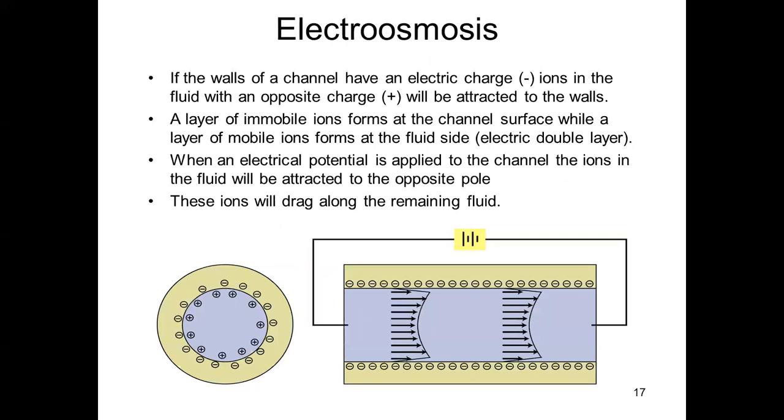So electroosmosis, if we take a detailed look at this: the chambers, the walls, form a charge on them, and then the fluid itself forms an associated charge to match the charge on the walls. When the walls are negatively charged, we draw a positive charge outside of the material, and so we build a charge gradient across the fluid. Naturally, when we try to use bias to excite and draw the fluid to one end of this device, we induce a fluid front, shown as concave in the drawing below.